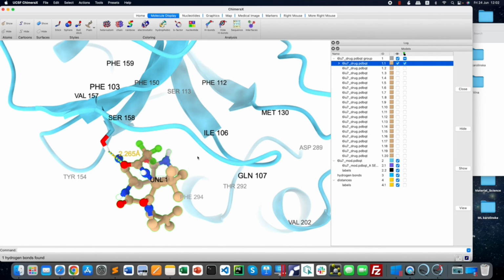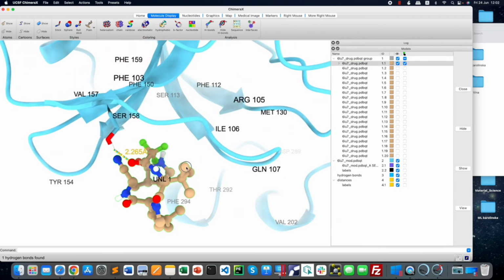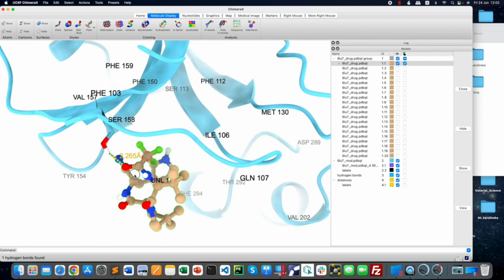Yes. So again, the original view you can bring down by using the molecular display hydrogen bonds, and then you can see the distance, and because you have already labeled it, you have everything written up here. Then go here, select and clear.